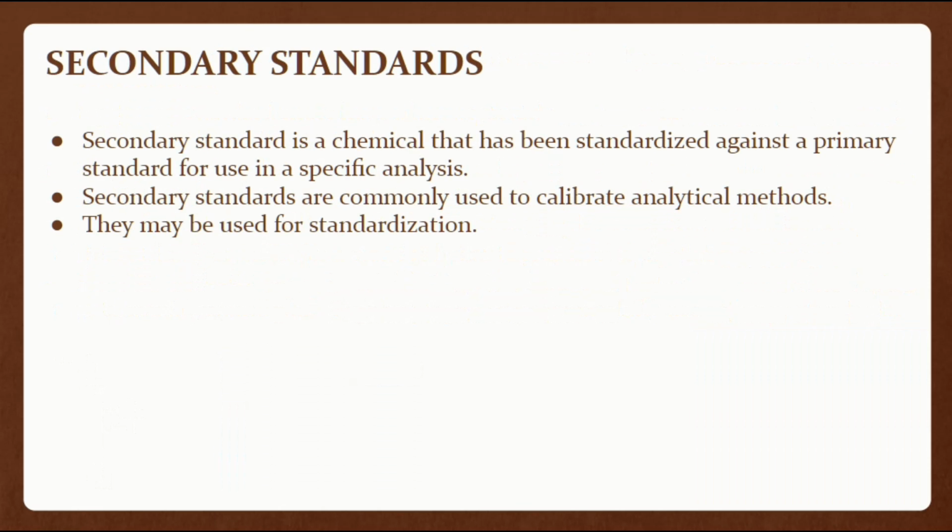A secondary standard is a chemical that has been standardized against the primary standard for use in specific analysis. Secondary standards are commonly used to calibrate analytical methods. They may be used for standardization. The base sodium hydroxide is an example of a secondary standard.